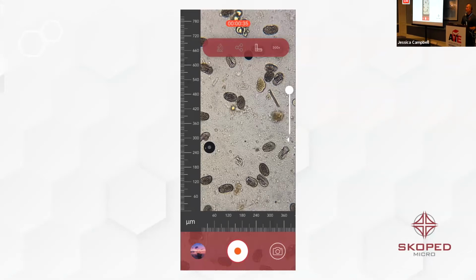And so in our meeting, I just had them talk about their problems, what everyday things. I was jotting down notes, and the two takeaways I had were, first, a better way to teach through a microscope. It's hard to teach through a microscope. I have clients all the time I used to bring back, and you're like, oh my gosh, it's the thing on the right, or even the girls and young men that have worked for me. Even when you're used to them, sometimes it's just hard to teach that.